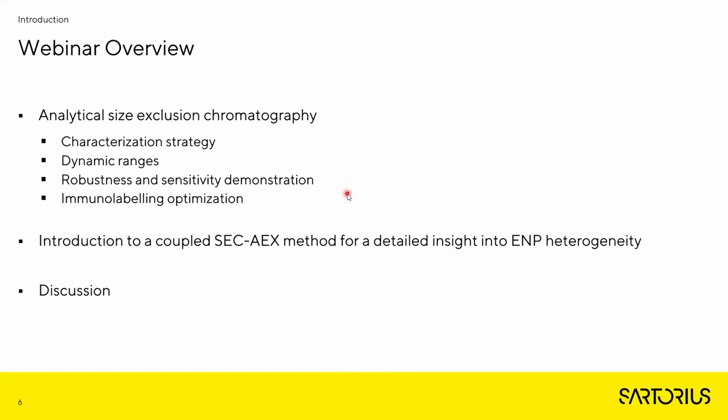And in the second part of the presentation, I will introduce you to two-dimensional coupled method that provides us a detailed insight into the extracellular nanoparticles heterogeneity.